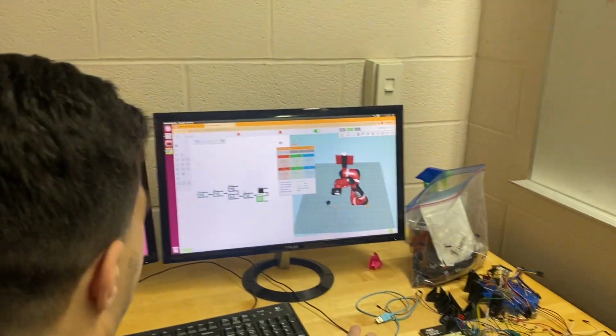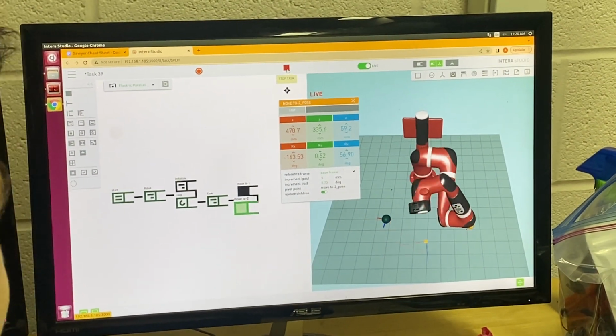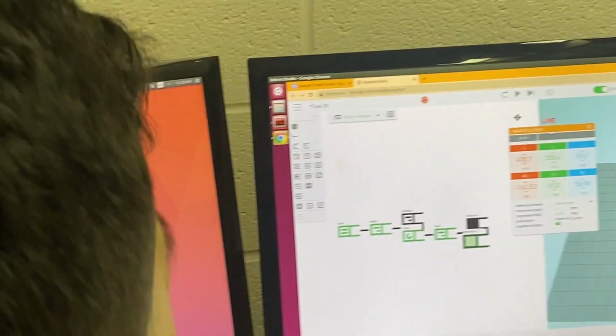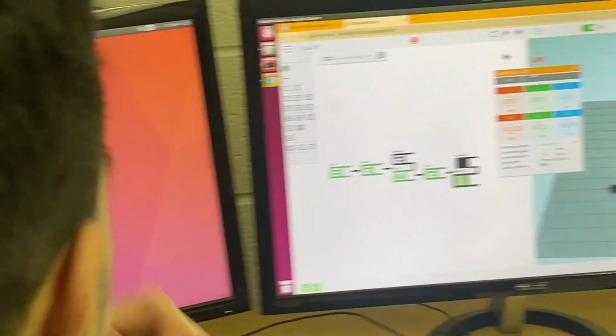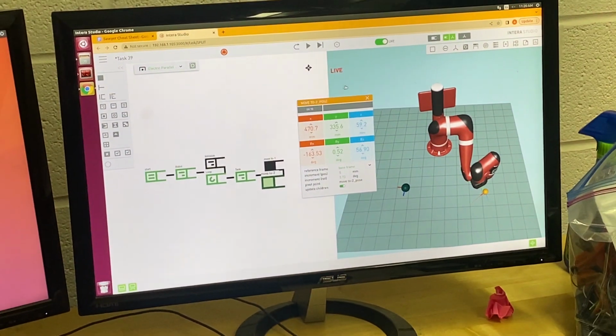Now you would ask me, how do you stop it? I have no idea. No, I do. Okay, it's right there. Cool. Big red button. Yeah, big red button. Oh yeah, or that one. Yeah, true. Not that big red button, but if you would really need to, sure.